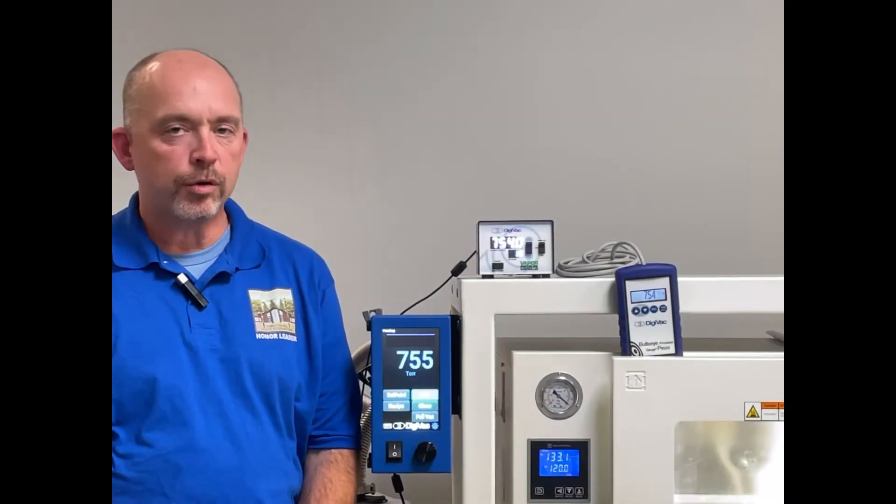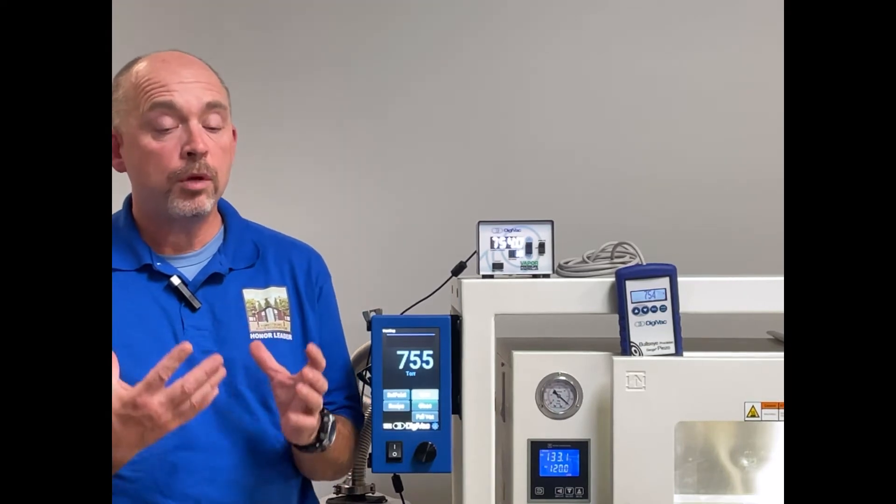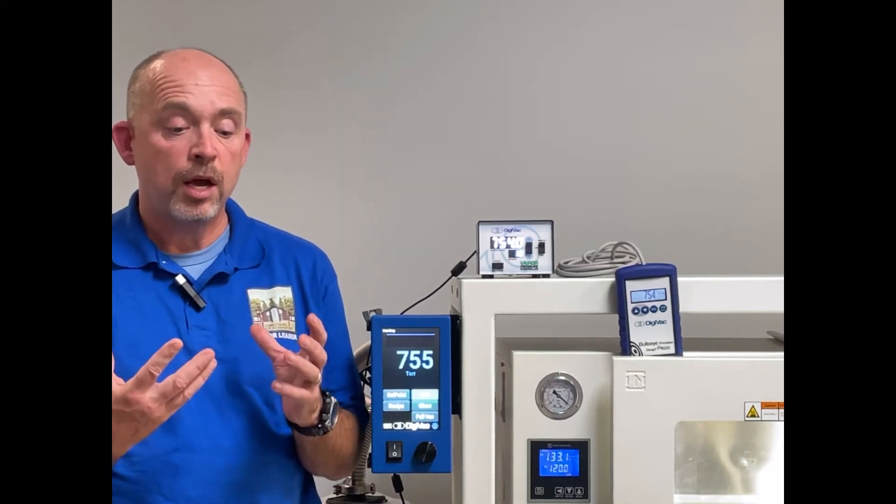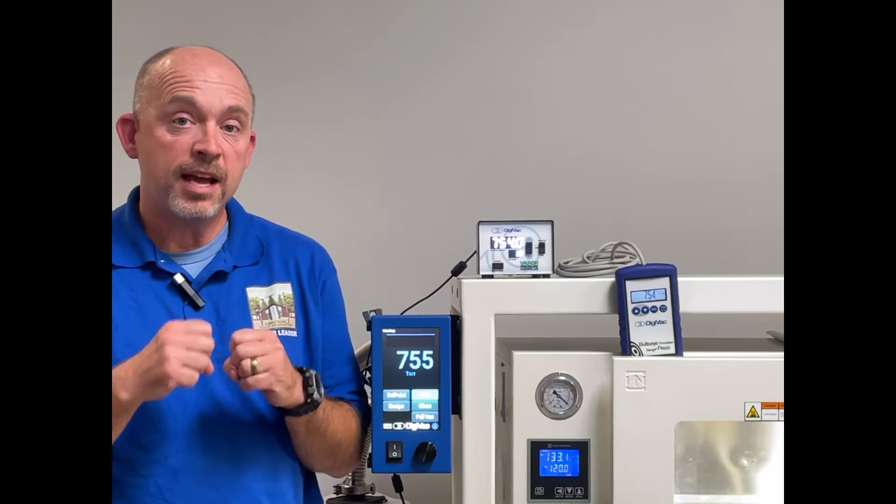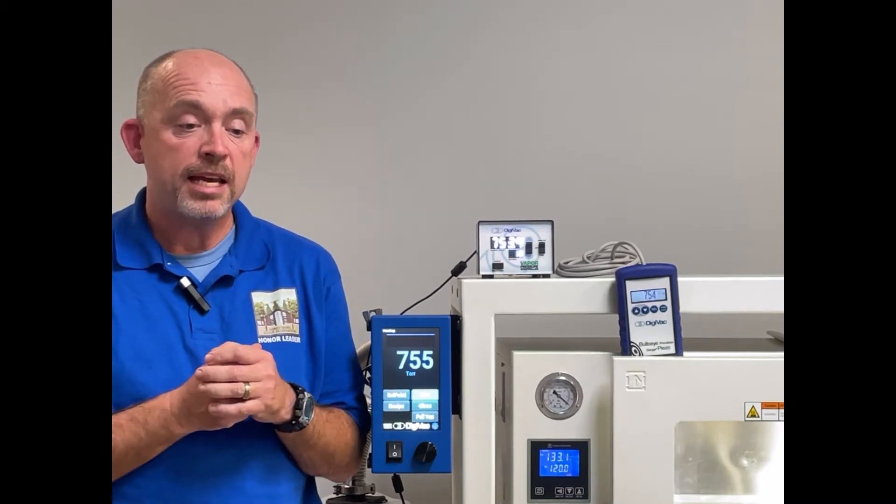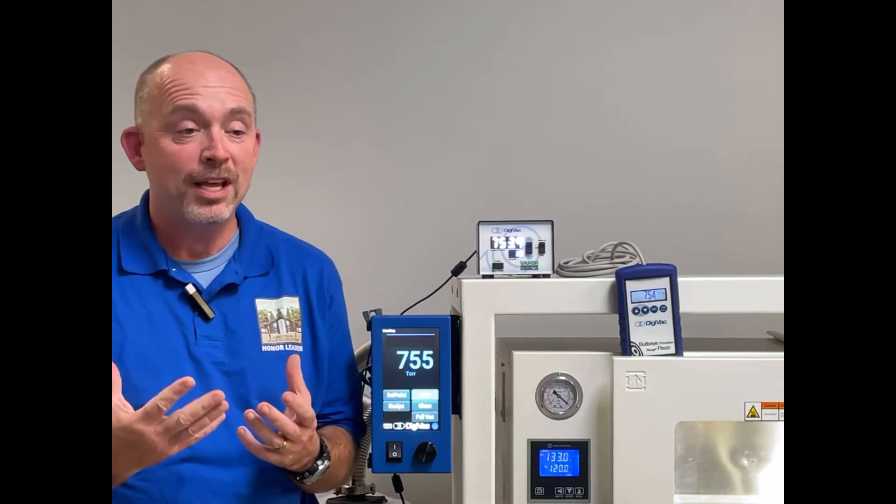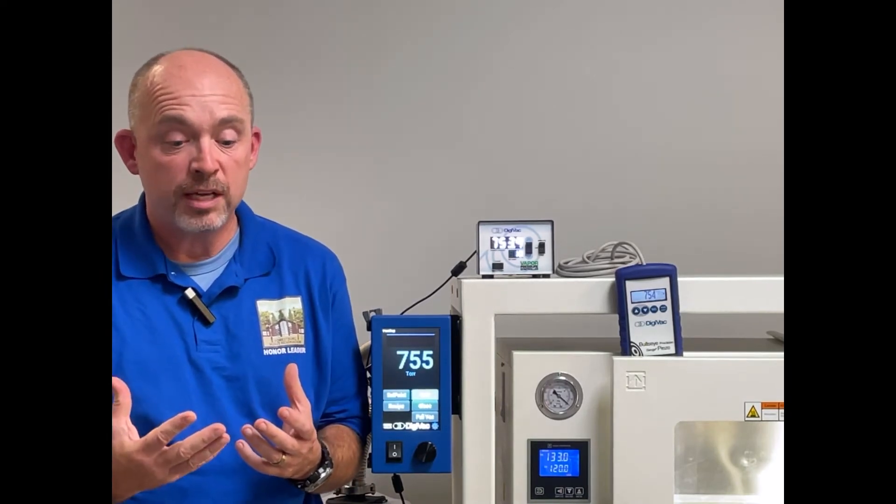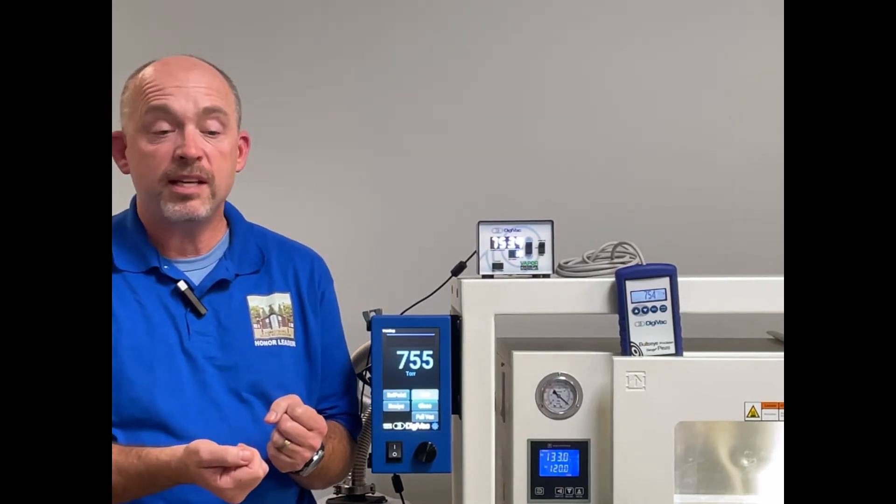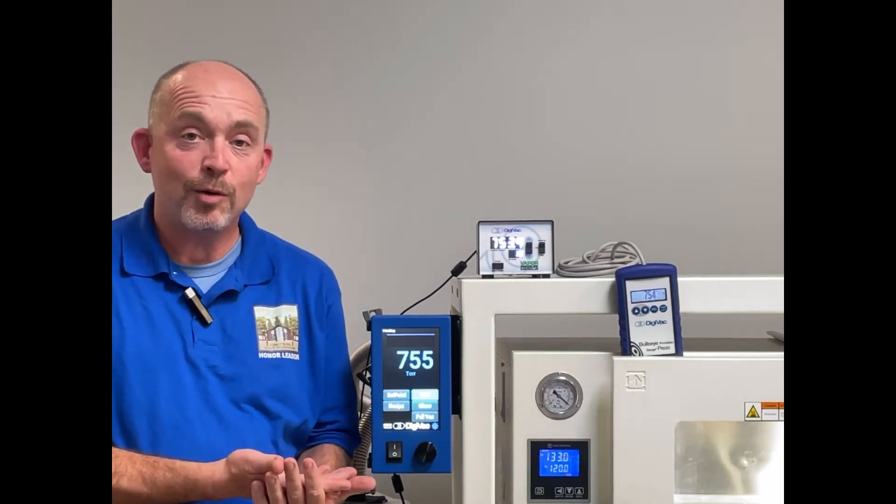What if you're drying powders? The problem with vacuum drying things that can fluff up is that if you're not careful and apply a full vacuum to powders, that vacuum can actually pull them up like a dust storm right into your vacuum pump.